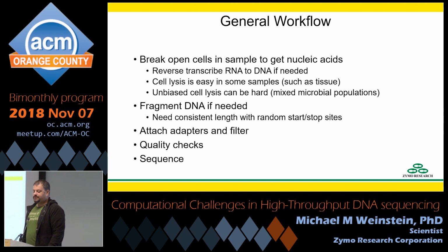So once you get your DNA, you're typically going to want to fragment it a little bit. That's going to depend very heavily on your sequencing method, but typically sequencing methods will have a limit to how far out they can reach. So for example, with Illumina, you're typically going to want to sequence fragments somewhere in the few hundred base range. You're going to attach adapters, and an adapter is essentially a dongle for random fragments of DNA. It's the thing that mediates the connection between the squishy stuff in the form of DNA and the hardware in the form of your DNA sequencer.